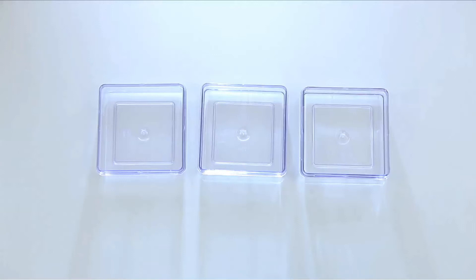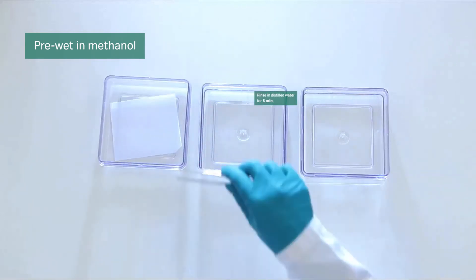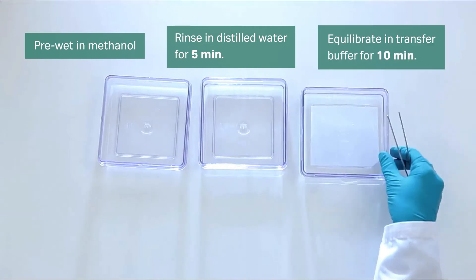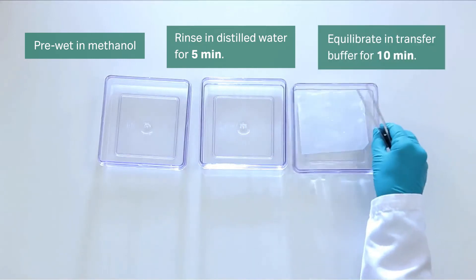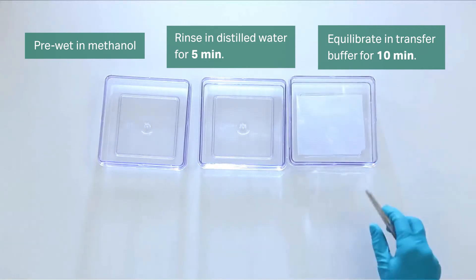As with all PVDF membranes, the Cytiva Hybond P blotting membrane must be pre-wetted in methanol, rinsed in distilled water for 5 minutes, then equilibrated in transfer buffer for 10 minutes. Always use a blotting membrane of the same size and shape as the gel and the correct size for the frame.